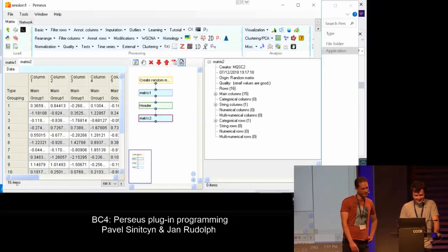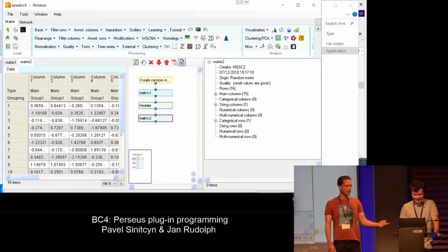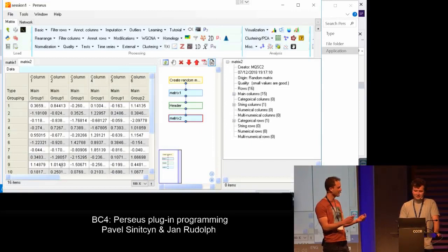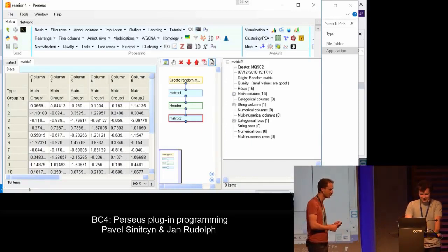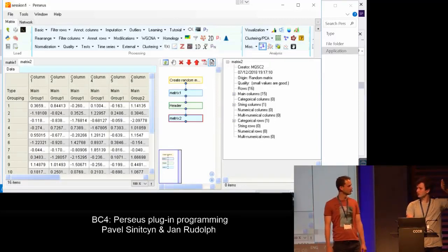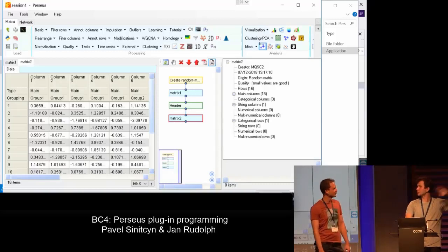Okay. So now all the time you have to change the plugin, recompile, and copy it. Is there some way? I mean, many of the things in Perseus have parameters. Yeah, it's true. You remember this clone activity, we just click on it and it was done, without saying anything. It's exactly the same as ours now.